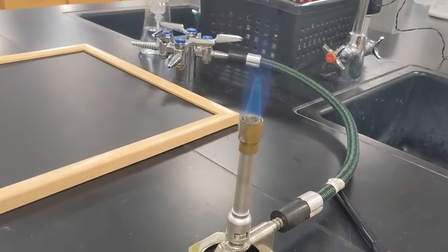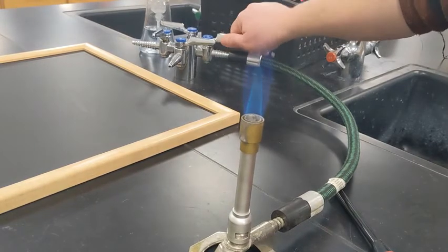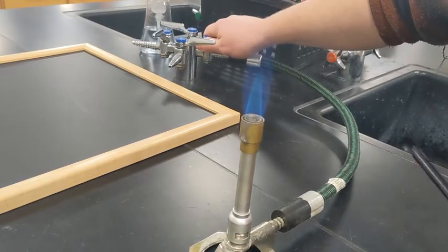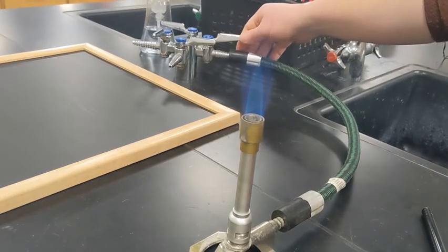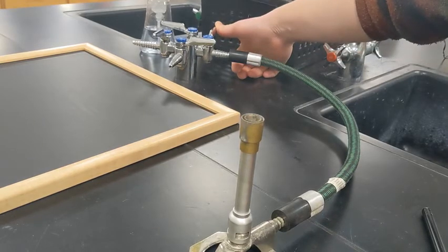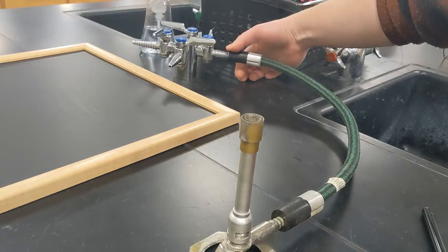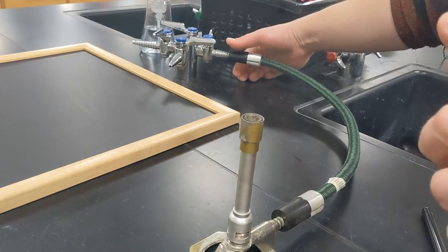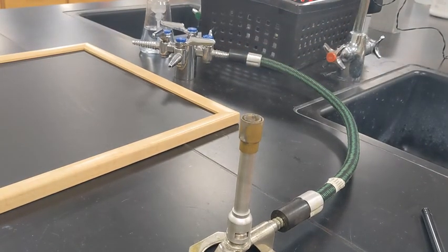In summary: make sure that when the gas is turned on, you are ready to light it. If you or your partner have to leave for whatever reason, turn it off. Don't walk away from a lit burner — even if you just have to walk to the other side of the room to grab something. Never walk away from a lit burner.